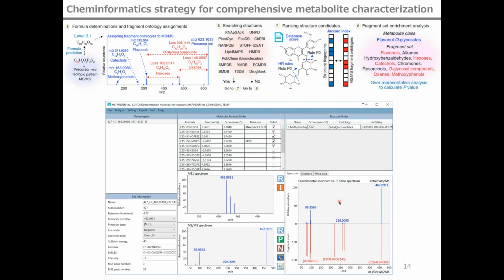And so this slide shows how users can elucidate unknown MS spectra. This is the main window of the MS-Finder program. Once users double-click this query, the program generates the candidates of molecular formula. Importantly, the program uses the information of carbon element count determined in this study by the MS-DIAL program, and therefore we can look only at the results of molecular formulas containing the specific carbon number, in this case 15 in this example.